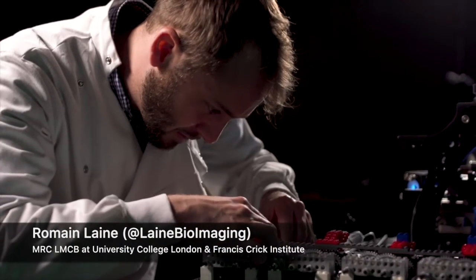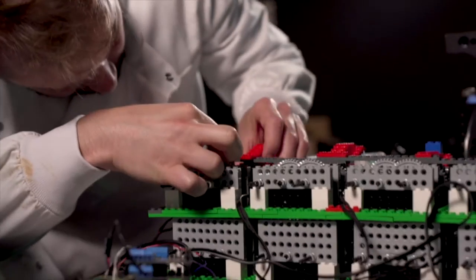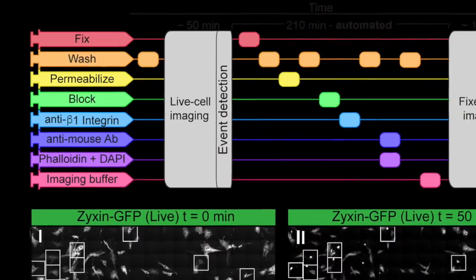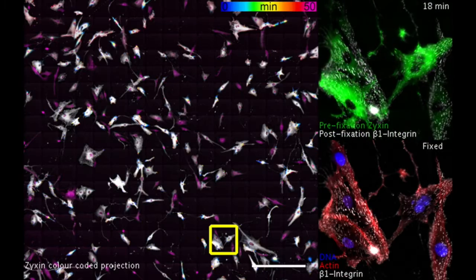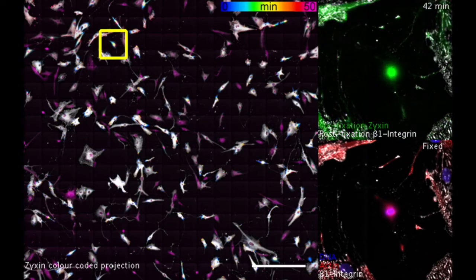Hi, I'm Roman Lehn. Let me tell you about some of the experiments that we can do with Pumpey. Pumpey can automatically cycle through multi-step liquid exchange onto the sample. This allows it to carry out protocols with several labeling steps sequentially.